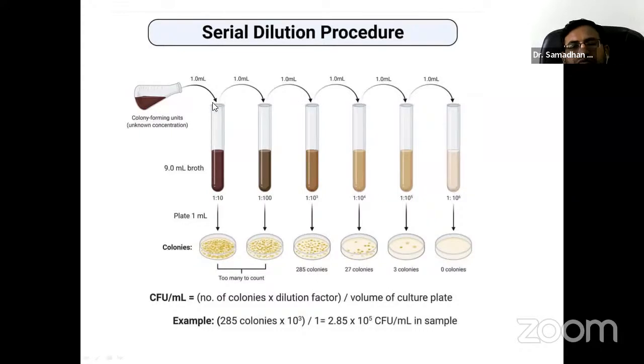From this dilution, take 1 ml and dilute it into another 9 ml of water. So it gives a 100-fold dilution, and making it serially gives 1,000, 10,000, 1 lakh, likewise. You make these dilutions and take the proper dilution to isolate the organism.